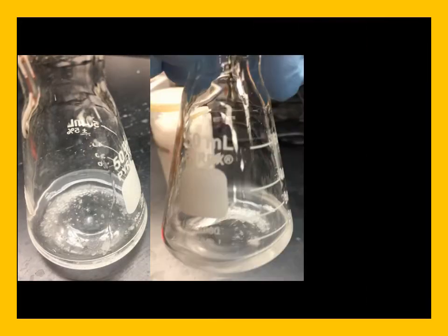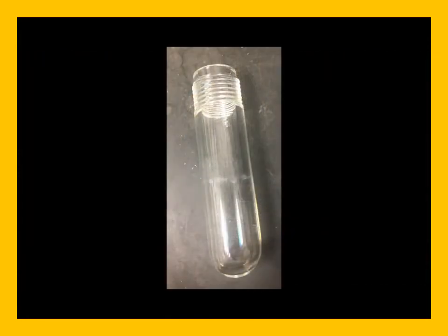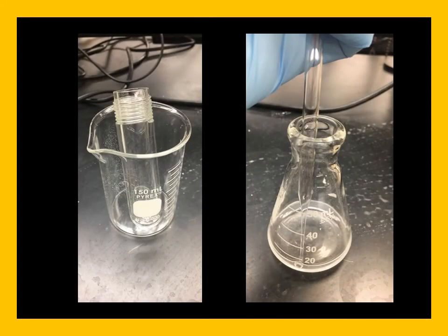First, add the water to the flask. It does not dissolve. However, upon swirling the flask, it now has formed a clear solution. Now I've obtained one of the microwave reactors. These are thick, heavy-walled vessels, and they have threading in order to allow for pressure buildup. I am resting this microwave tube, since it has a round bottom, in a beaker, to make sure it doesn't fall over. And I want to transfer about a third to a half of my potassium carbonate solution into this vessel.